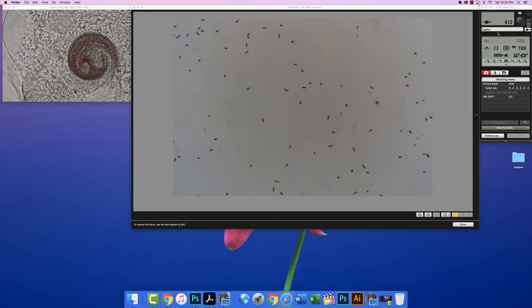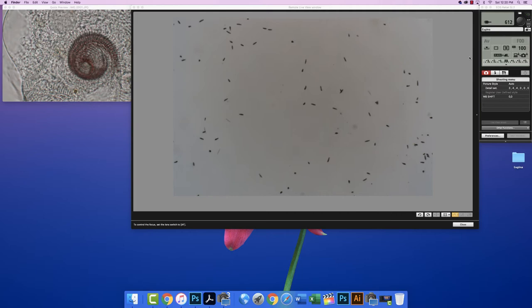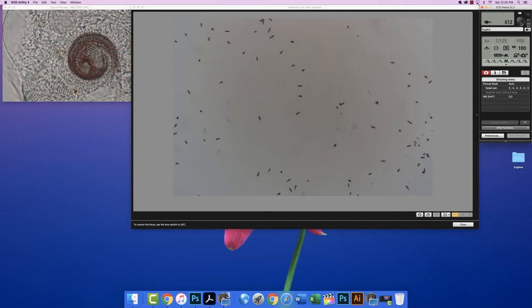So these guys are much smaller than the Stentor, and obviously they're much faster, so they're moving around at a pretty good clip. This is at 5x, so I'll take a photograph. And there's our photograph of Euglena.